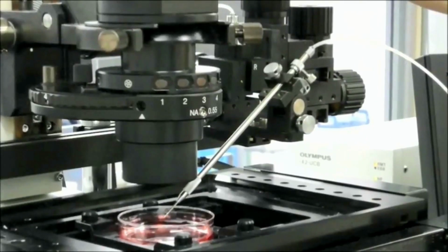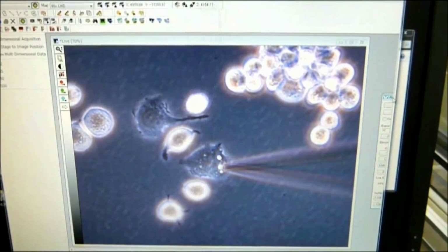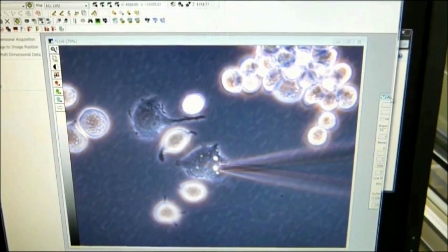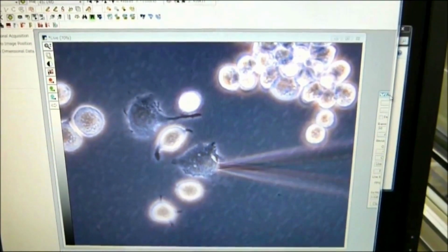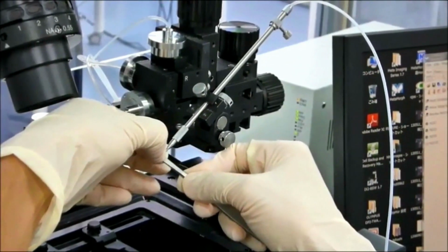How it works is relatively simple. You have a capillary holder. You sample part of this very unhappy cell, or the whole cell if you want to. Then this part of the cell is trapped at the very edge of the capillary. So you disconnect the capillary from the capillary holder and add an ionization solvent or an extraction solvent from the other end of the capillary.